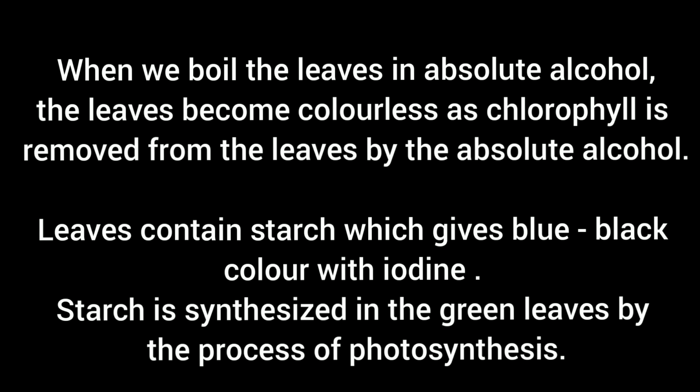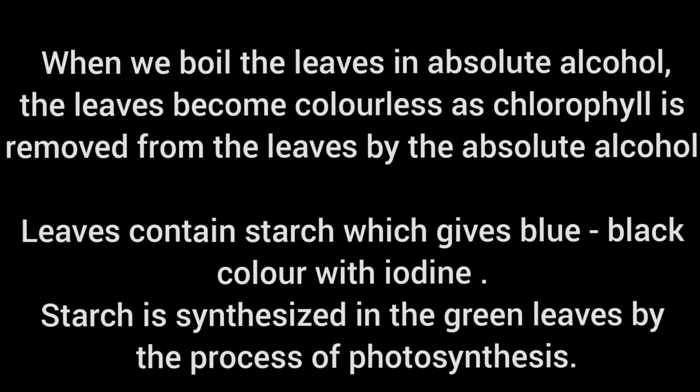When we boil the leaves in absolute alcohol, the leaves become colorless as chlorophyll is removed from the leaves by the absolute alcohol. Leaves contain starch which gives blue-black color with iodine. Starch is synthesized in the green leaves by the process of photosynthesis.